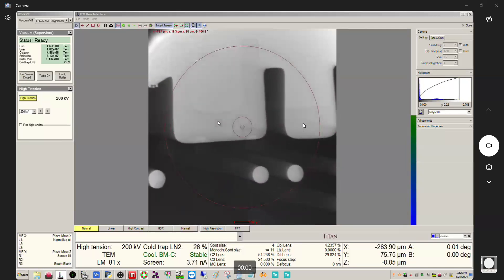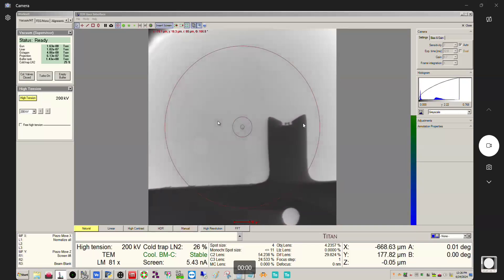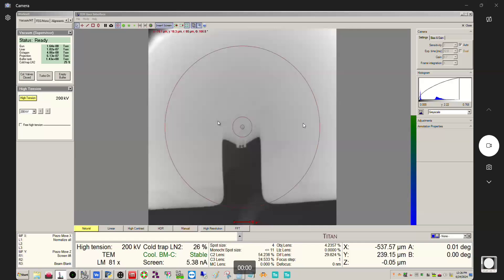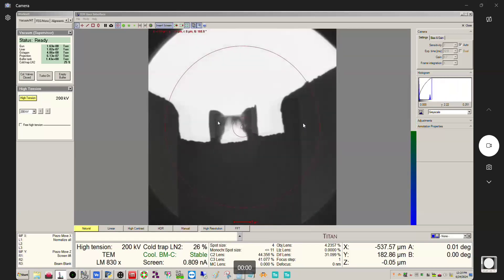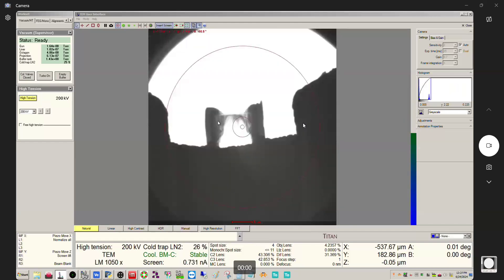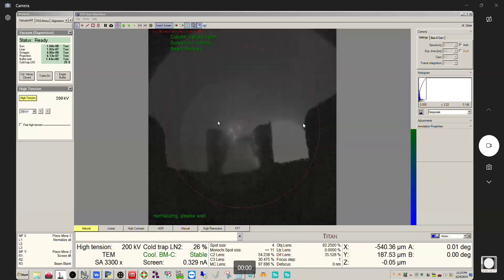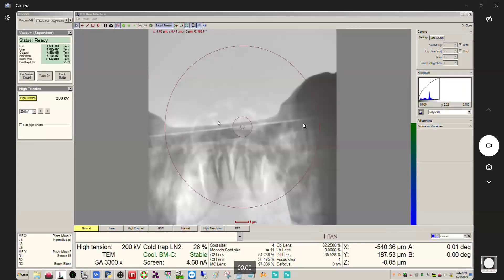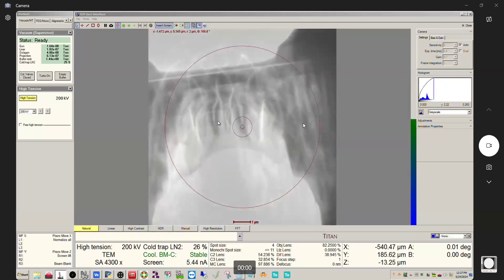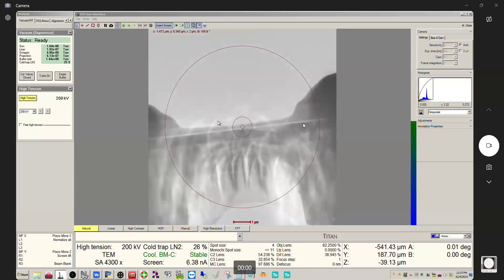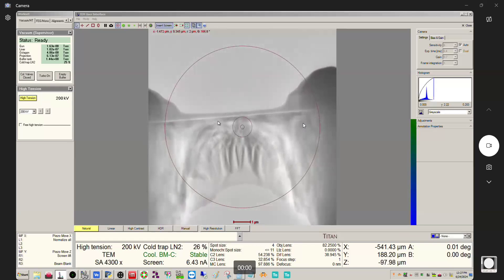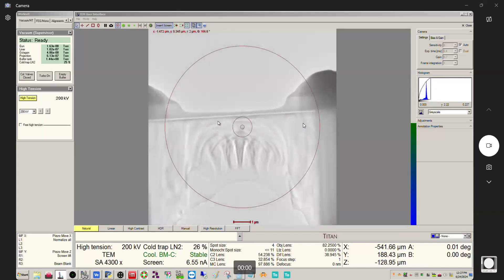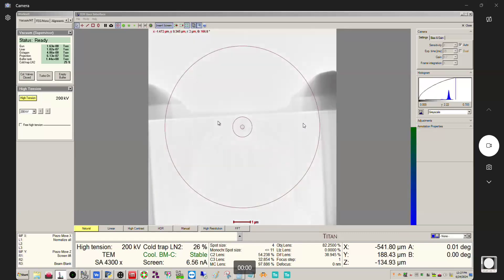I'm going to go over to where I know the lamella is — it's right here in the notch of the one-dot post. In our case we didn't have a problem with the beam being spread out too much or shifted too far from center; our problem was that there was something non-transmissive in the way. Very quickly, I'm going to set eucentric height here. Eucentric height is good.